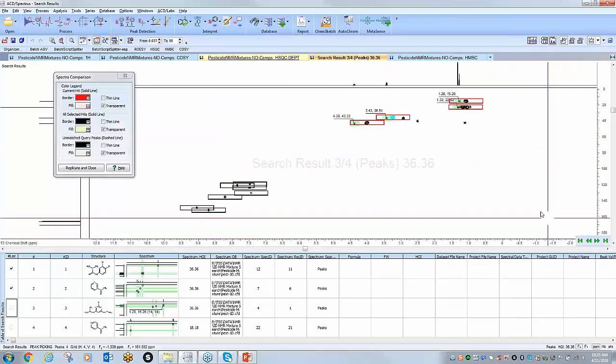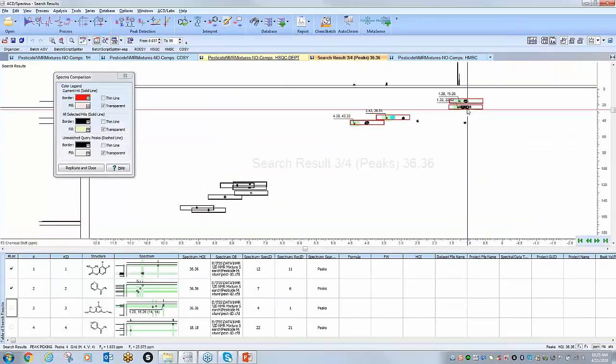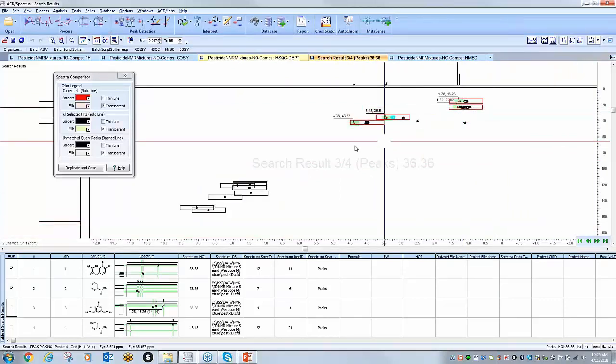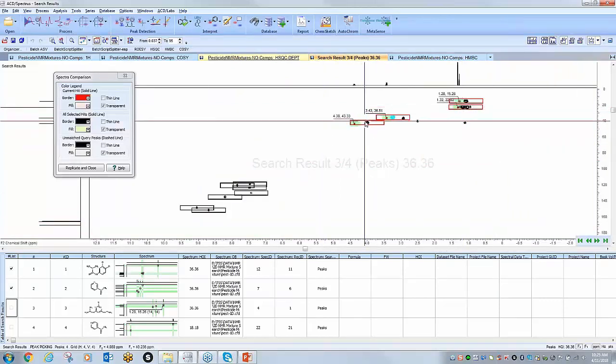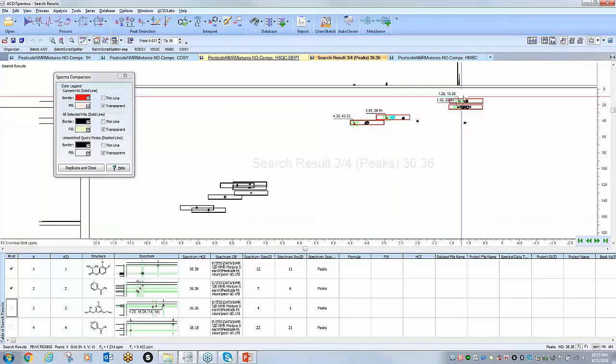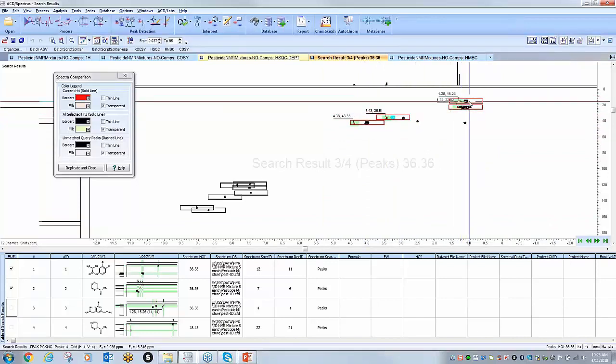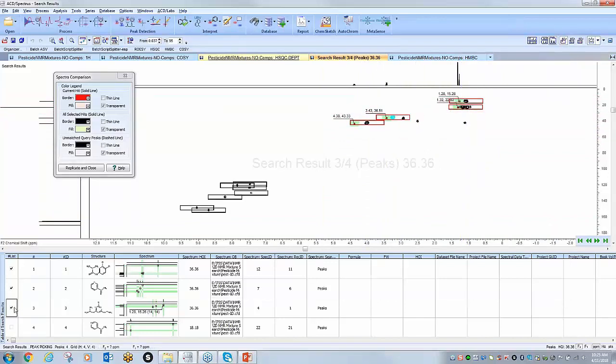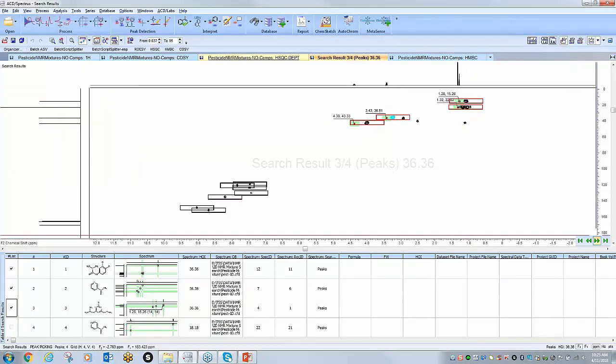And you see the third hit is in fact a good one corresponding to these particular signals, so I will go ahead and select it, and then I'll move on again.